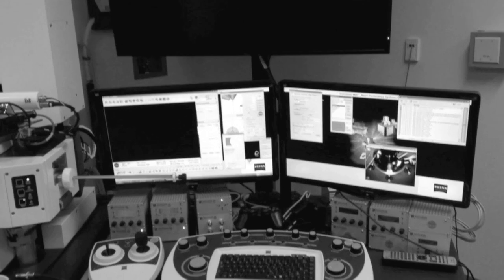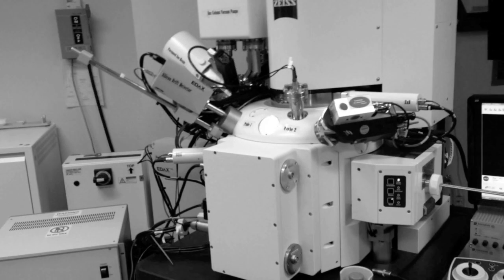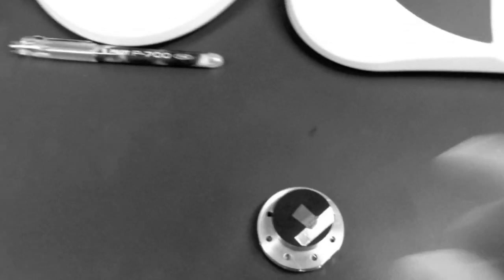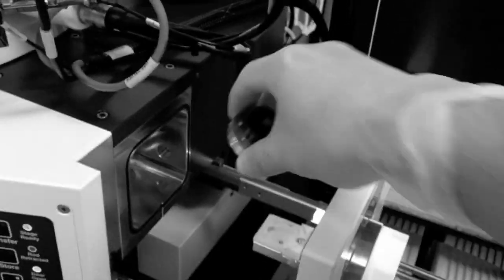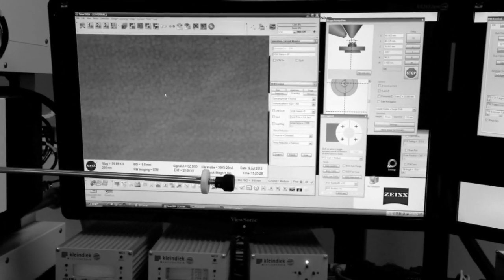NASA Glenn owns a scanning electron microscope specifically designed to image magnetic materials such as cobalt. Here I'm loading a sample into the chamber to investigate the microstructure of my alloy. The computer display shows the two-phase gamma plus gamma prime structure in backscatter mode.